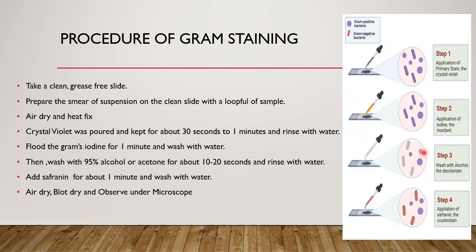See, these are gram positive cells. These gram positive cells will remain purple itself. Why? Because they have a thick peptidoglycan layer, so they cannot wash off the purple stain, and as a result they remain purple. Whereas these are gram negative, and gram negative cells have a thin peptidoglycan layer and the lipid layer will get dissolved, and the purple stain will get washed away at this step.